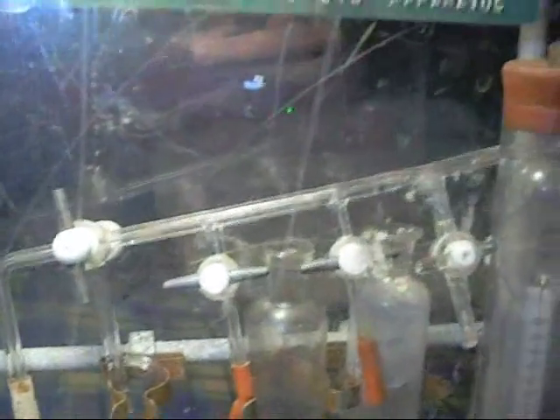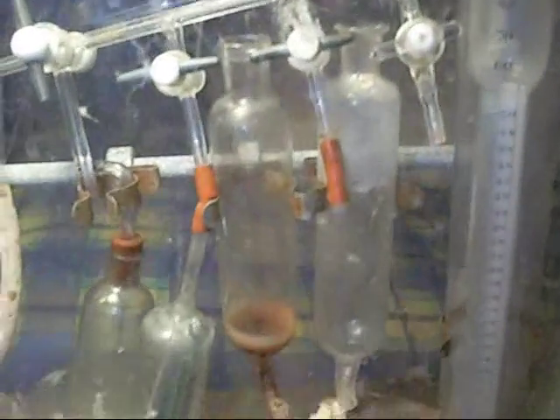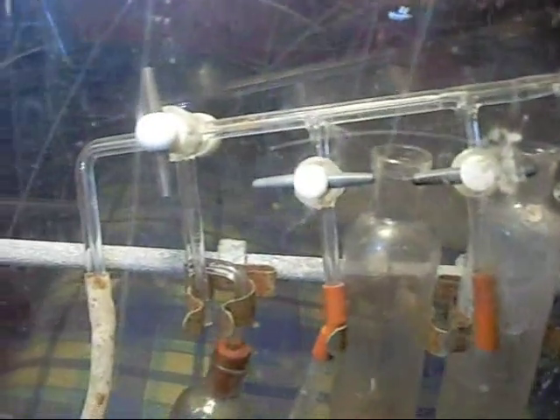I'm not going in there yet without gloves on — I don't know what kind of chemicals and reagents have been used in it. But yeah, I just thought I'd show you. Interesting setup. I like that manifold there with the taps on it.